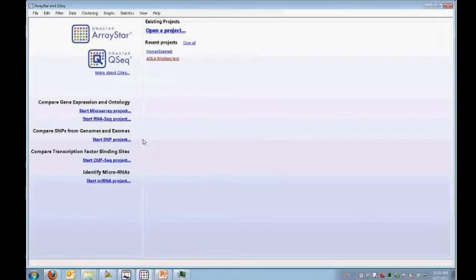The contigs will be more accurate. Your templated assemblies will also place more reads and do it faster. I guess the third thing I would mention is support really is a big difference. When you're using open source software, you may not get any support other than online forums, which may or may not be accurate information for you. With DNASTAR software, you can contact myself, the other scientists here, and really get top-notch support on all the different projects that you're doing.